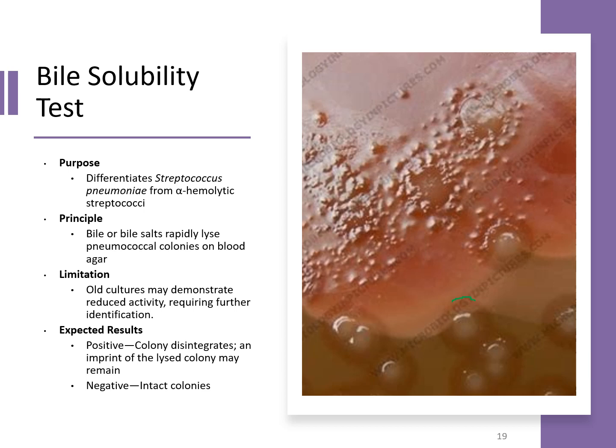And where you see here that you've actually got nice little colonies, and then that reagent has been dropped onto that colony plate, you can see the remnant of a few colonies here where those colonies have been lysed by that reagent. And so as that colony disintegrates, it can start to kind of leave an imprint of where that colony was at.